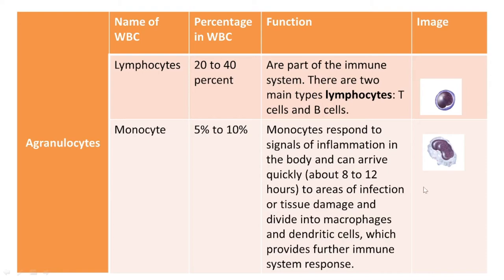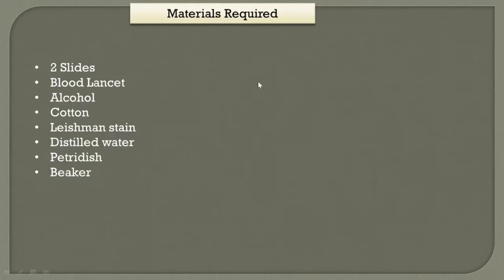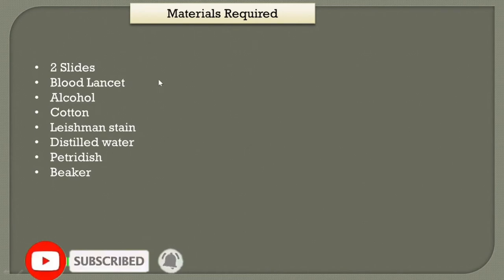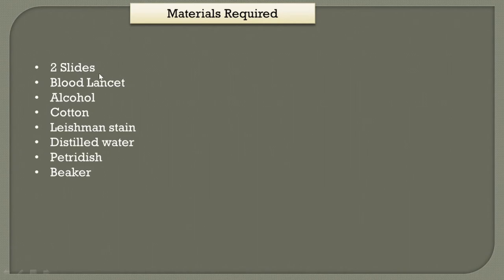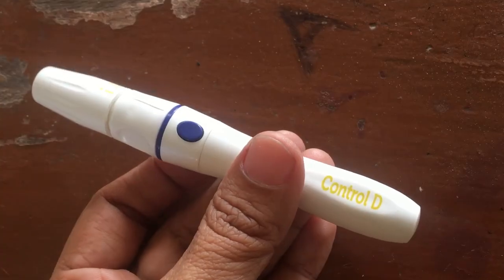Next we are going to see the materials required for doing this practical — preparing the blood smear and observing different types of WBC. We need two slides, a blood lancet, alcohol to disinfect our finger, cotton, Leishman stain (this is the stain we are using for this practical), distilled water, a petri dish, and a pipette.